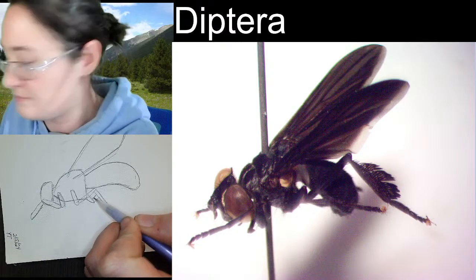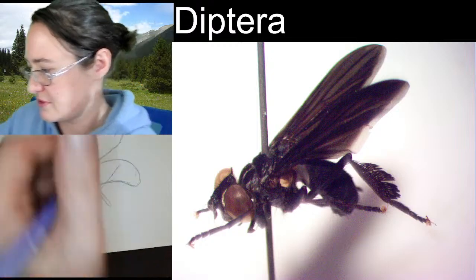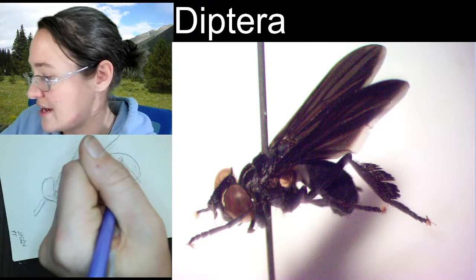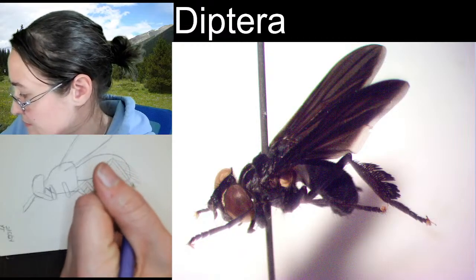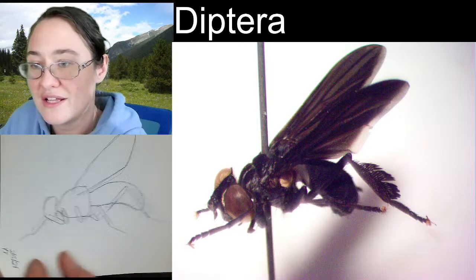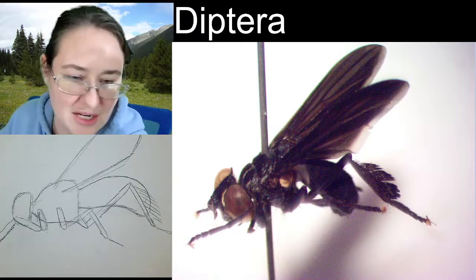And then the femur is this one that comes all the way up. And it looks like I pulled my abdomen up a little bit, so I don't think that the femur is going to go above the abdomen. But the femur is the long one that comes up. And then that part on the hind leg where you have all of these hairs here, those are going to be on the tibia. And then you've got tarsal segments that are coming out, out, and out. Cool. So that gives us a really nice light outline for our fly here before we zoom in and check some of this stuff out.